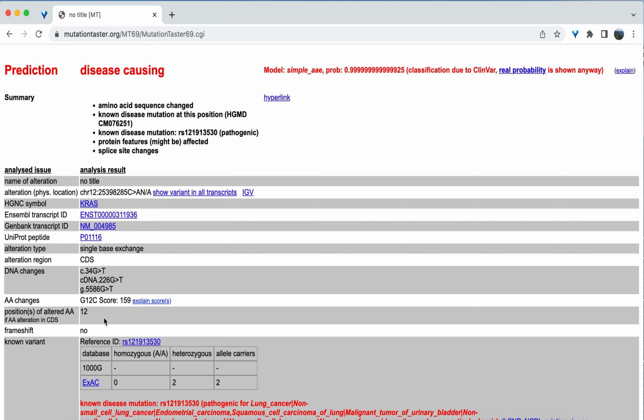For single base changes causing missense mutations, there's a score given to the change. The score is an estimate of the severity and is a value between 0 and 215. This number is based on the similarity of the amino acid substitution, considering its structure and function. Larger scores are given to bigger differences, and smaller scores are given to an amino acid substitution that is more similar. Ignore this field for all mutations that are not missense mutations, including insertions, deletions, and nonsense base exchanges.